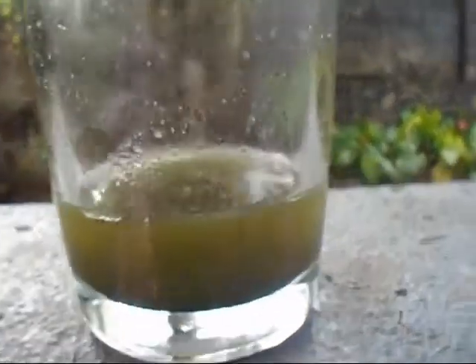Now you can see after the reaction, the solution looks like this. I am going to add some water to dilute the solution, then wash the precipitate and collect the boron.